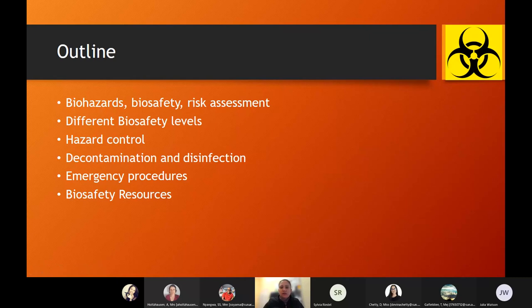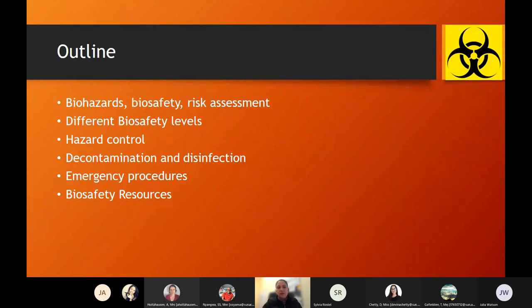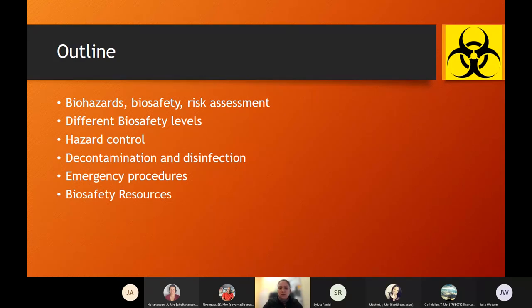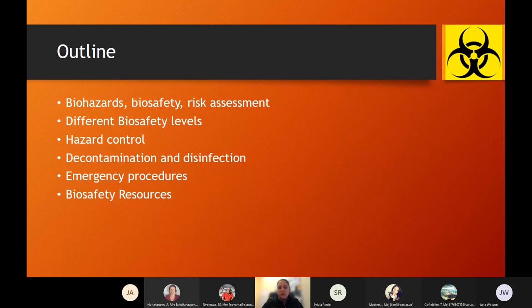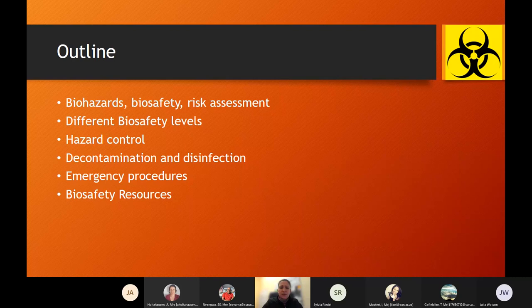The outline of what we're going to talk about: I will talk about biohazards, biosafety and risk assessment — basically everything that has to do with biosafety. We'll go through the different levels of biosafety, then move on to the hazard controls we implement in our laboratory. I'll cover decontamination and disinfection, emergency procedures specific to my lab, and the last slide will provide some biosafety resources I found very useful.